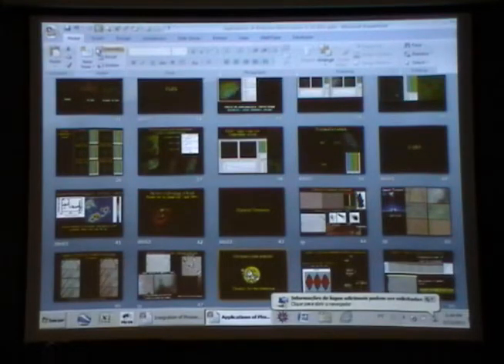That's a kind of problem. If you do have the autofluorescence, then you're going to try to trap them, but they can kind of move around like the microorganisms that we have seen. The way that the biologists get rid of this is to glue them on the bottom part of your cover slip. So they have some kind of coatings that the samples go down there and stop there.